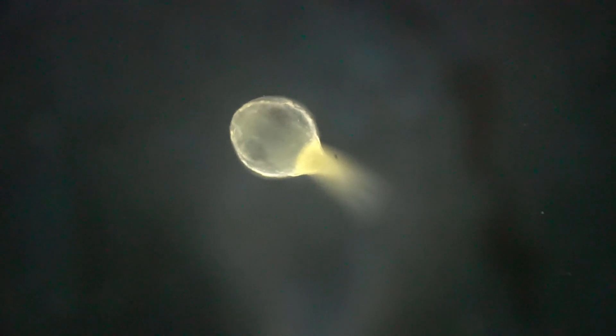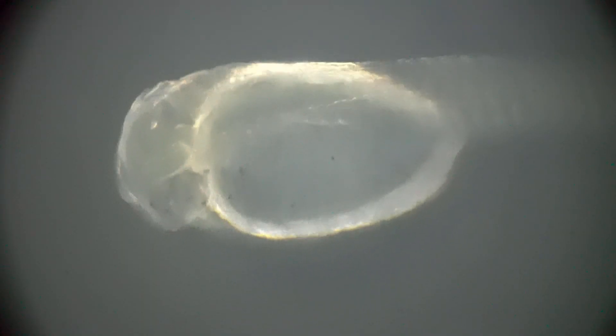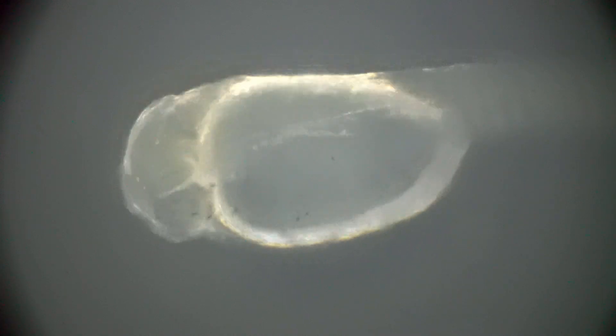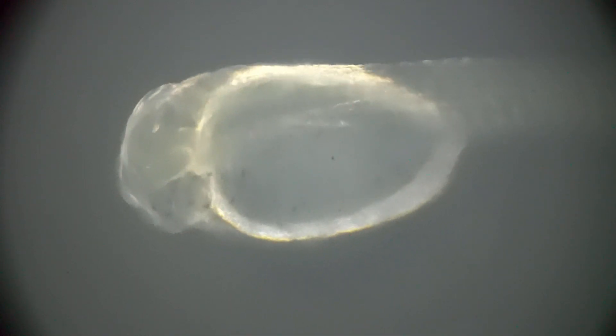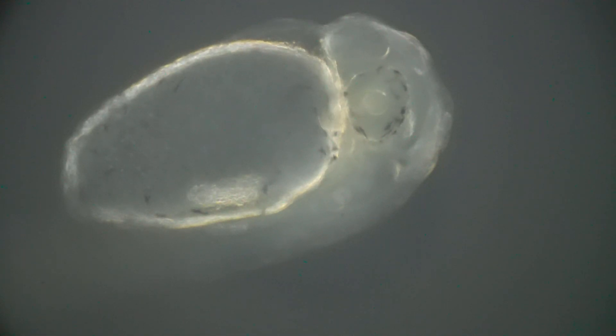It was really interesting to see that the eyes of these fry are not fully developed when they hatch and that it just takes a little bit more time, about a day or so, before you can actually see a fully black eye on this fry. It's really cool to see the heart of this fry beating and to see the plasma and the fluids flowing throughout its organs and whatnot.